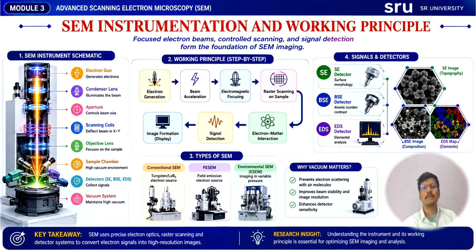In summary, the SEM is a sophisticated instrument that combines electron optics, electromagnetic focusing, scanning systems, detectors, and computer processing to create highly detailed images of material surface.